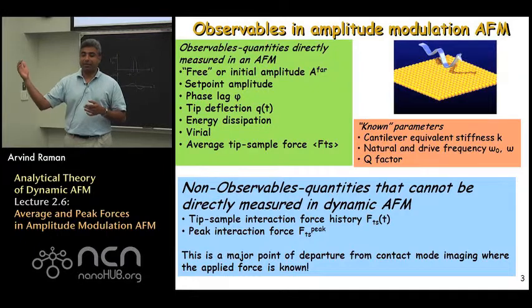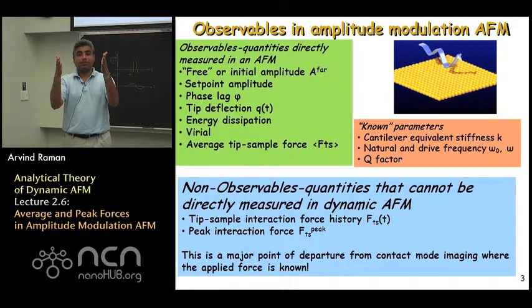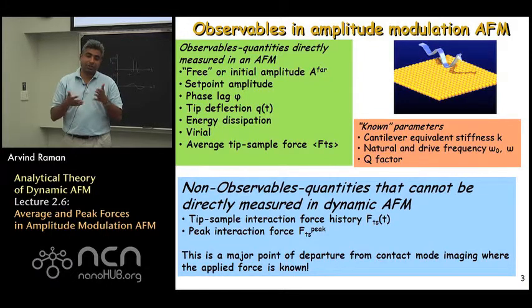We talked about the fact that as the tip oscillates and comes close to the sample and moves away, there's a small interval of time in which there is an interaction with the surface, and the actual profile of how the force changes between the last few atoms in the tip and the first few atoms in the surface is actually not observed directly in tapping mode AFM.